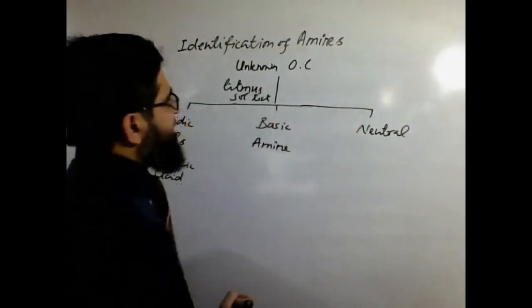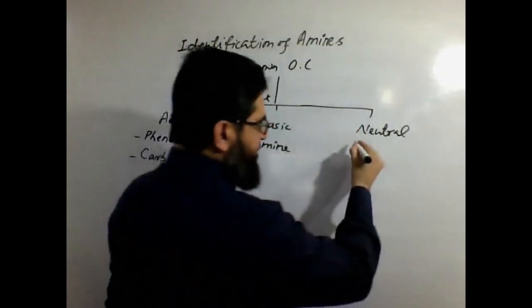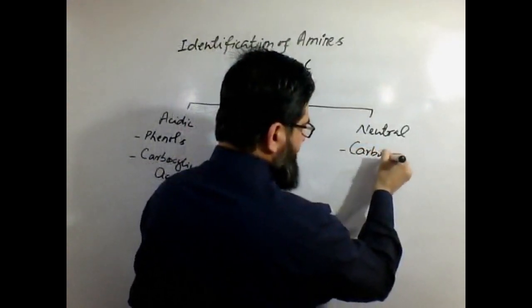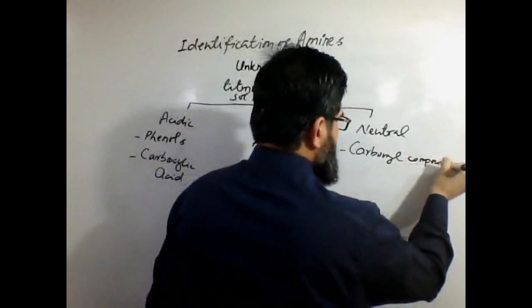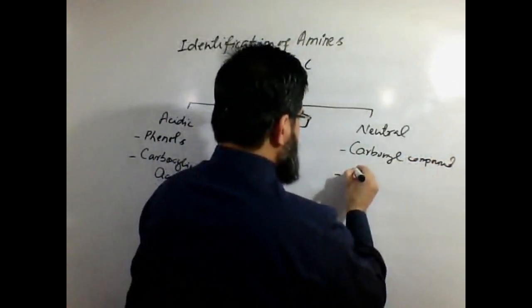However, if the test confirms the unknown compound is neutral, then it could be a carbonyl compound, or it could be a carbohydrate.